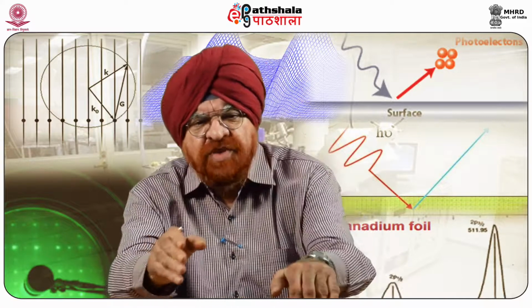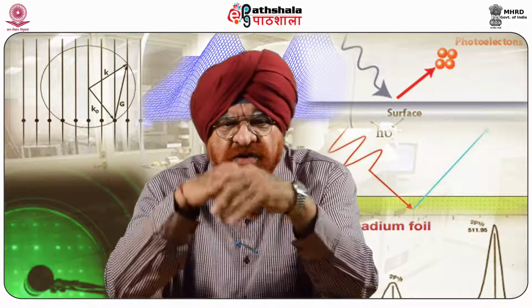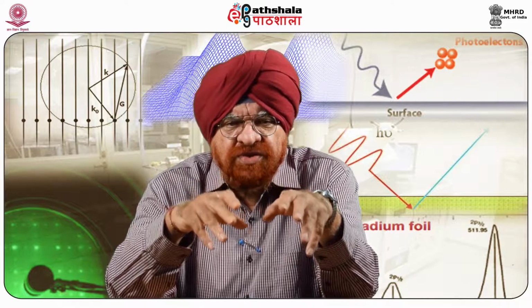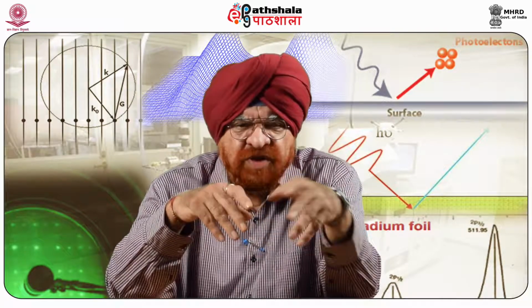On the other hand, the AFM can examine a field of view larger than 125 microns, that is 0.005 inches. This is done so that we can make comparisons with other information, for example, features seen in the light microscope or hazes seen by eye. The AFM can also examine rough surfaces since its vertical range is more than 5 microns.